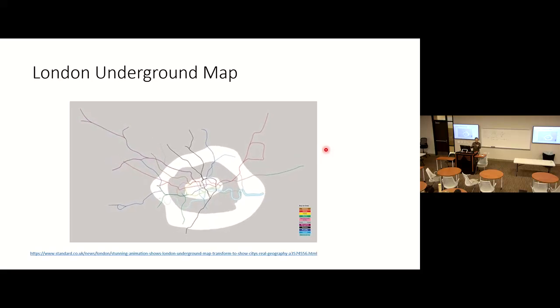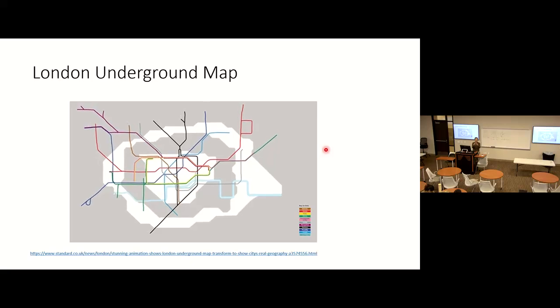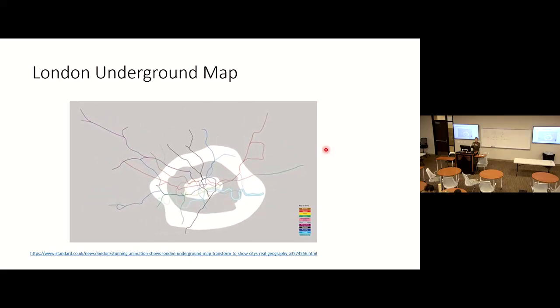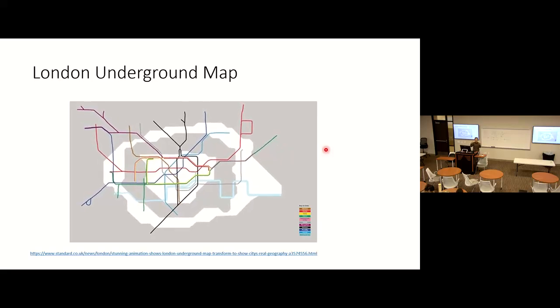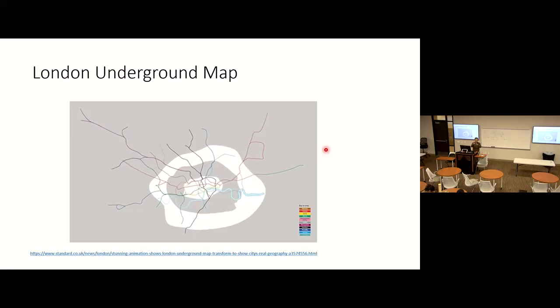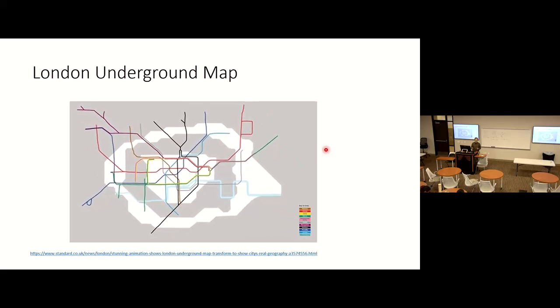So in order to visualize the more crowded center points, you need some kind of transformation. Just like this, you transform the data and artificially introduce some space in between, allowing the detailed relationship between points to be visualized, okay?